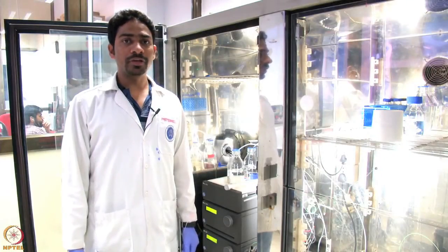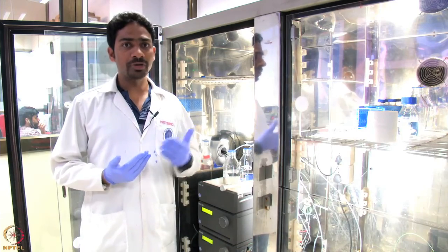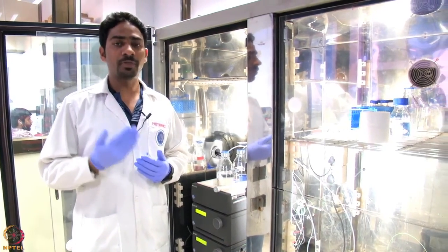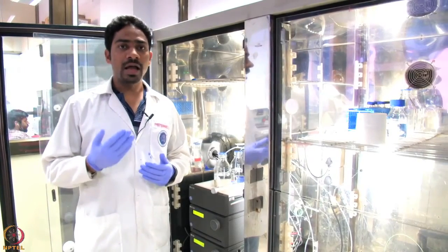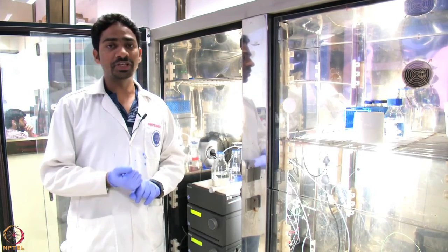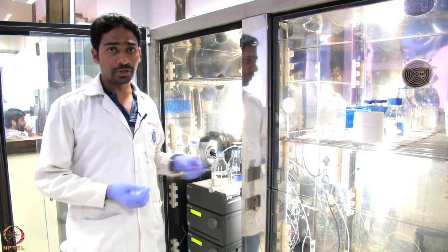Hello. So, today we are going to discuss about protein purification. Protein purification is generally used to isolate a single protein or a few proteins from a complex mixture of proteins, and we are exploiting different properties of the protein, such as the hydrophobicity of the proteins, the affinity of the proteins.